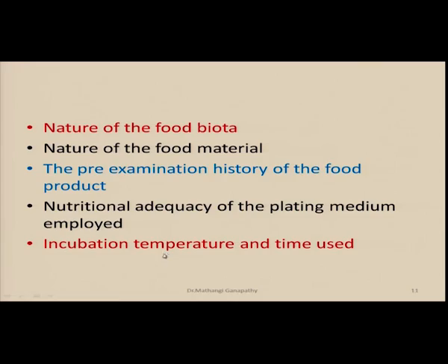So all those pre-examination factors. Then when you take the sample, its condition, what was the nature, you have to observe all those. Was it neatly packed, did the pack have any breakage, what was the condition, what was the temperature. All those things will also determine the microbiota which are present on the particular sample concerned.